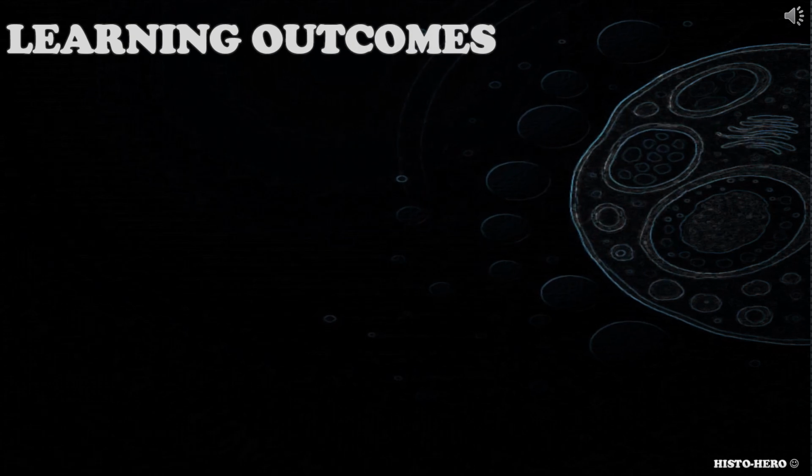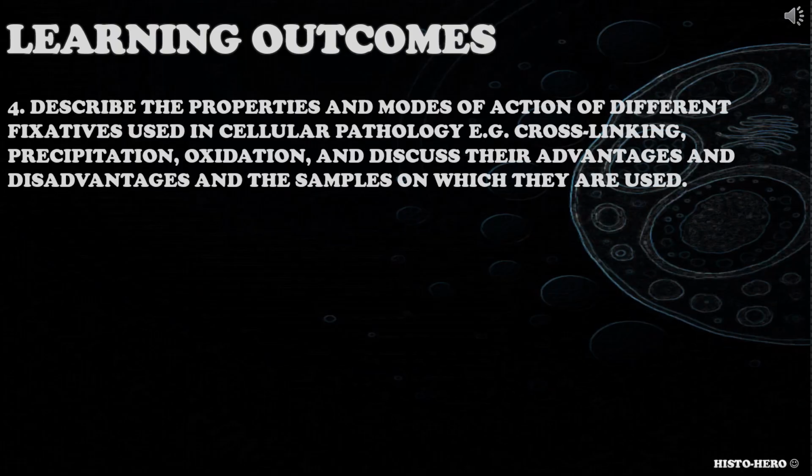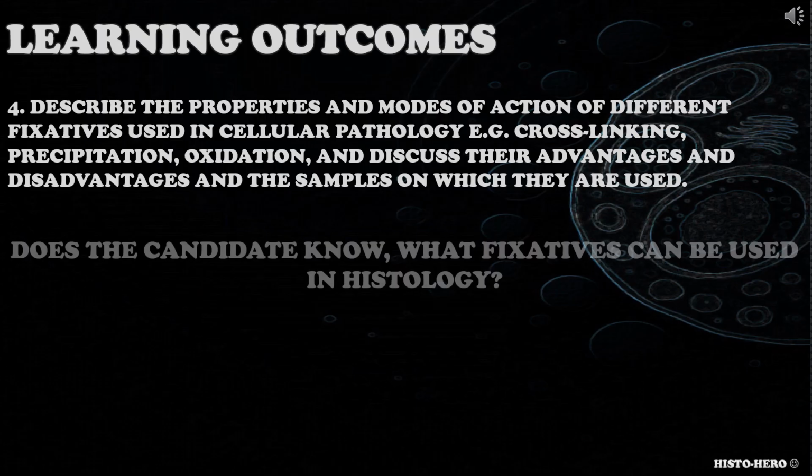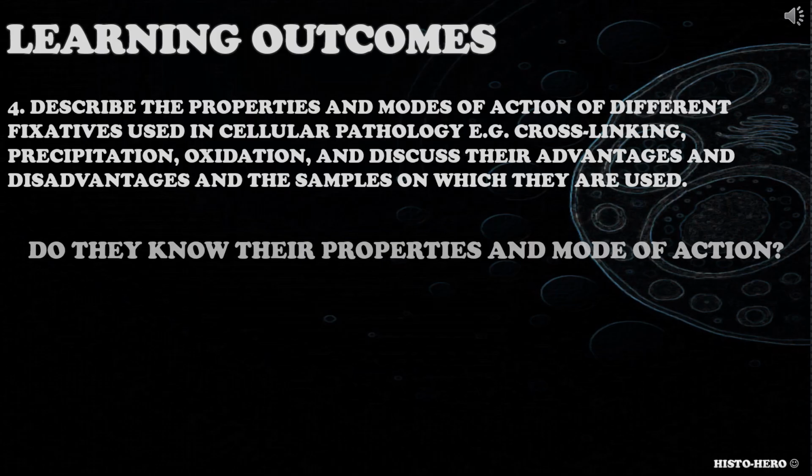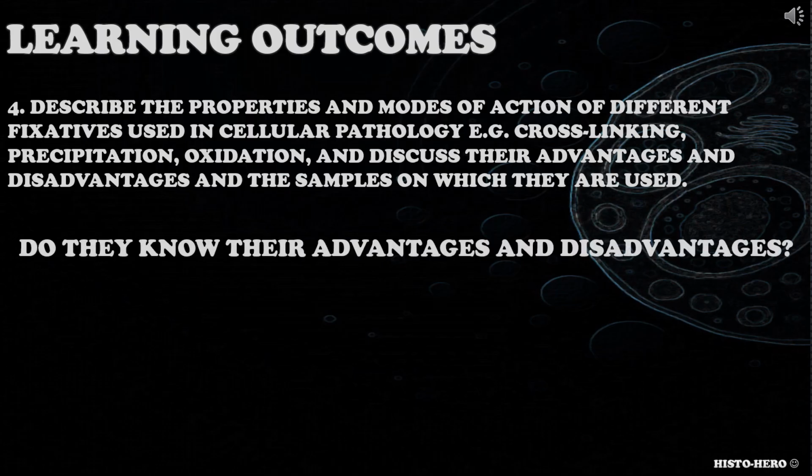The fourth learning outcome is, describe the properties and modes of action of different fixatives used in cellular pathology, e.g. cross-linking, precipitation, oxidation, and discuss their advantages and disadvantages and the samples on which they are used. Candidate needs to know about various fixatives. Does the candidate know what fixatives can be used in histology? Do they know their properties and mode of action? Do they know their advantages and disadvantages?